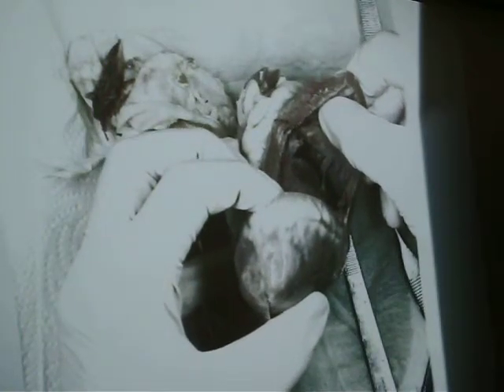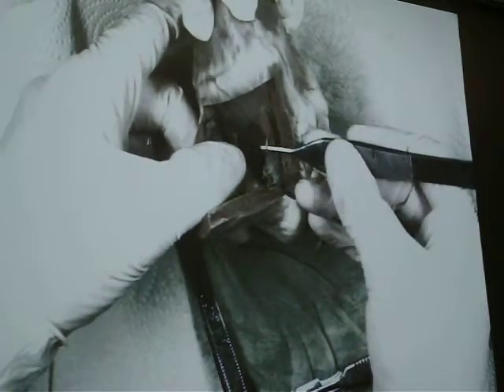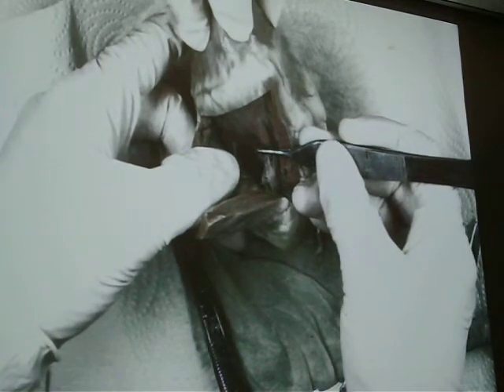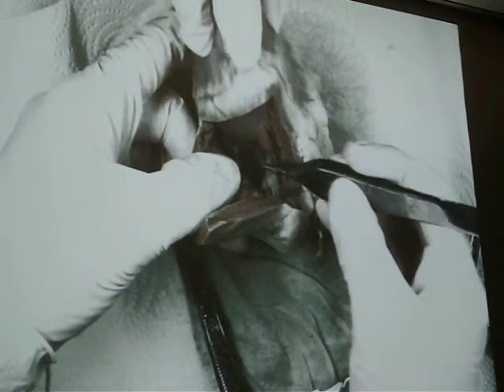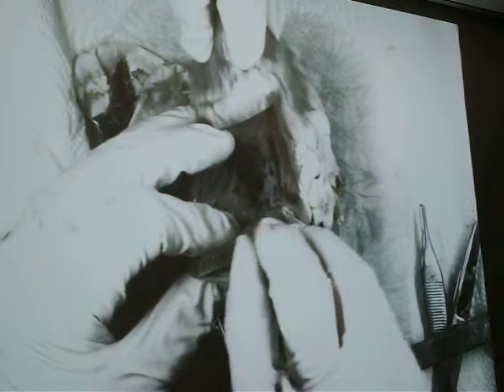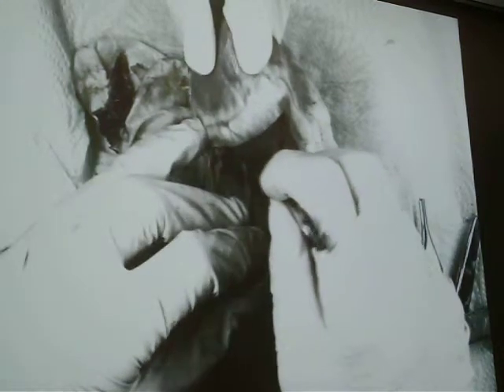See it? I'm going to go down a little bit further. I've opened up some more. You can see some chordae tendineae here, can't you? The right AV, or tricuspid, valve is not quite as impressive. The chordae tendineae are not as prominent; the whole thing just doesn't look quite as big. But we've got a nice valve flap here — tricuspid valve. We've got some nice chordae tendineae and a nice little papillary muscle. And we can look up past the valve and see into the right atrium.